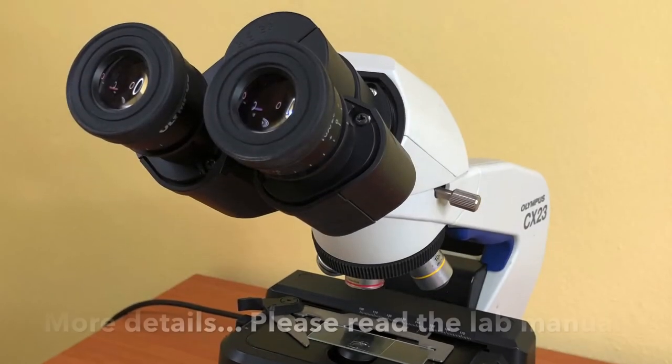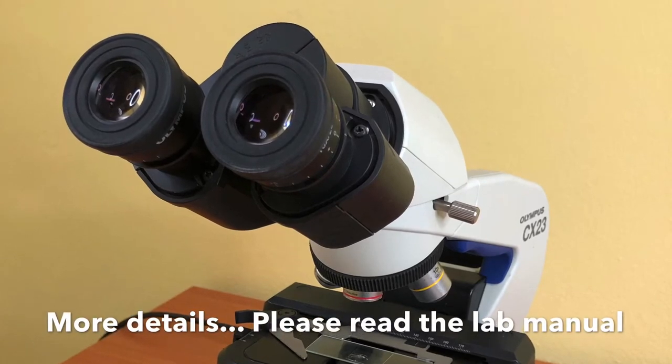For more details of the other parts, please read the description in the lab manual.